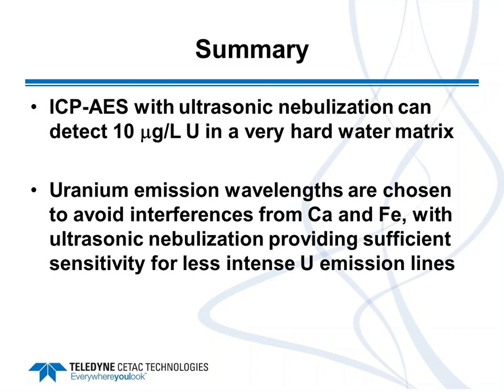Are you using internal standards with your system? No, we did not in this case because we wanted to see just how good or how not good the data quality would be in this very hard water matrix. Certainly in practice, you would use an internal standard to compensate for changes in the sample matrix, perhaps using traditional internal standards such as scandium and yttrium.